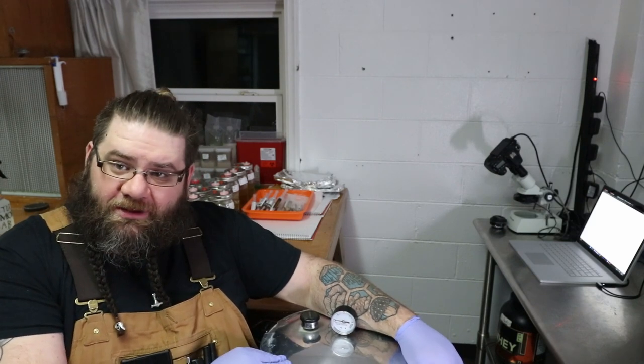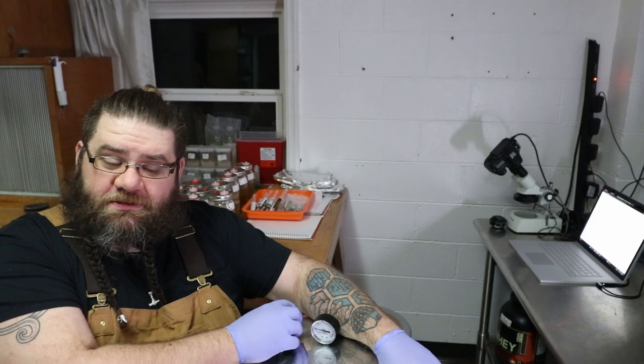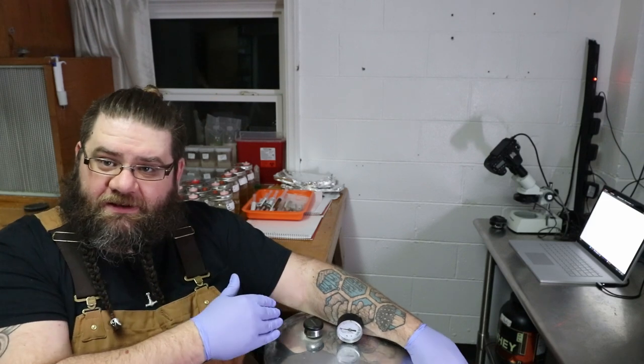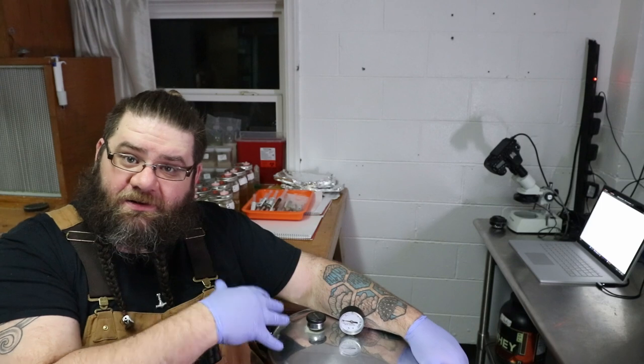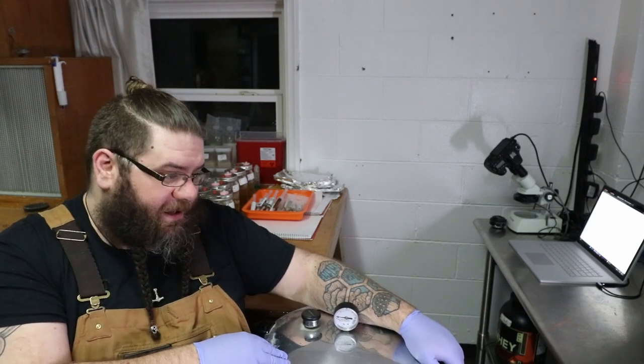Downsides to these are that you gotta babysit them, you have limited amount of room, they don't hold pressure, they're gonna suck air in, so you're gonna either want this to cool down in front of a HEPA filter, which can also oftentimes make it cool down too fast, lose pressure too fast, and cause the agar to bubble out, liquid culture to boil off rather.